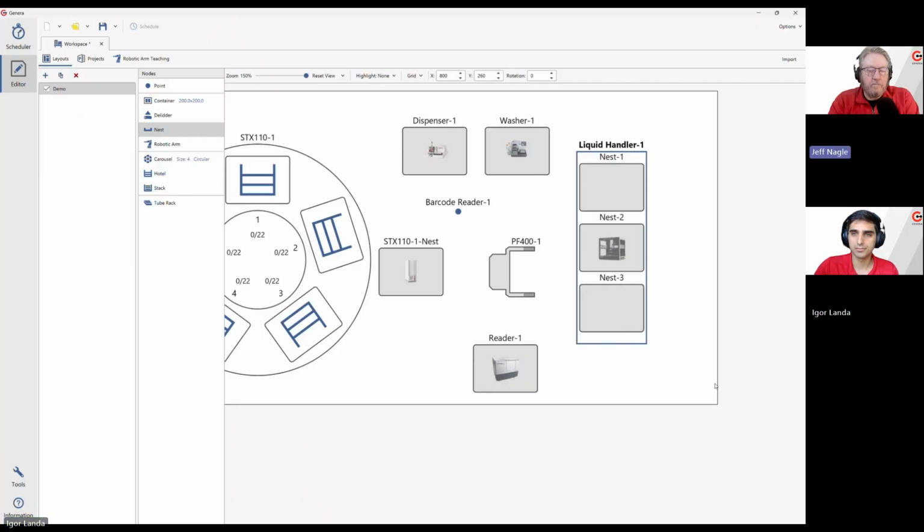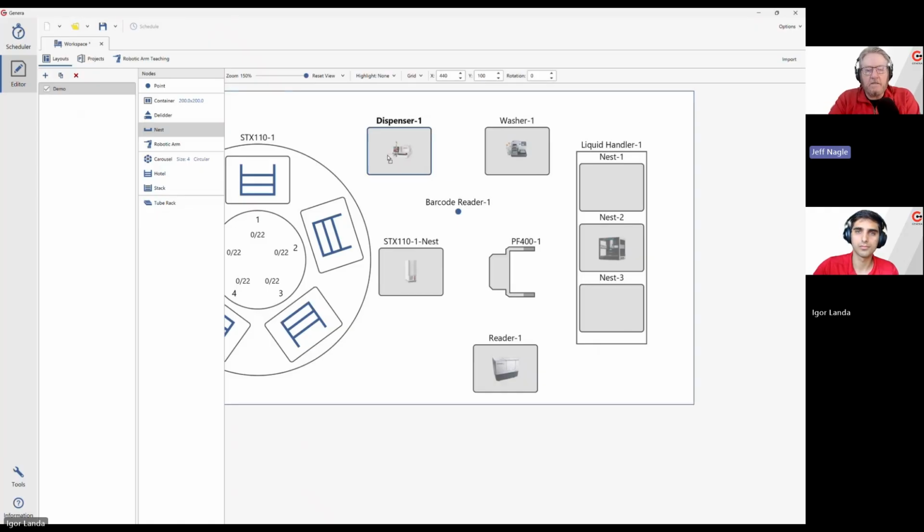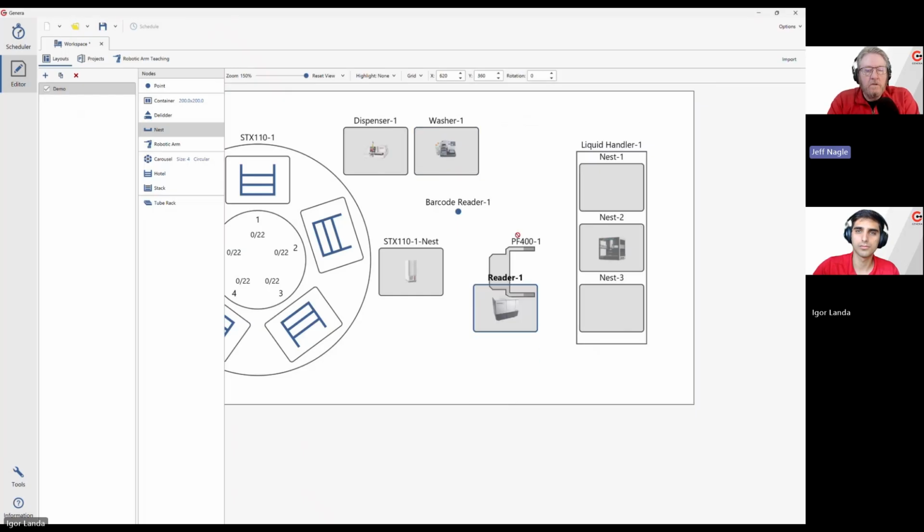Yeah, the inheritance property from the container is awesome because, like you said, Igor, it transfers directly into those nests. Unlike the ones you're just moving now, where you see the instrument association already. But because of the inheritance, it's already there. So you won't see the instrument inside nest 1, 2, or 3 because it's inside that container.